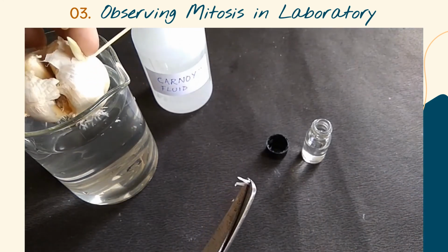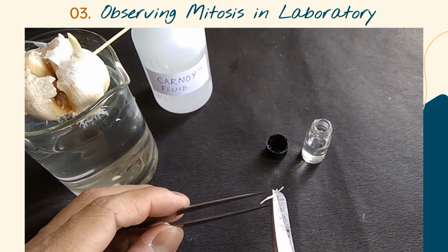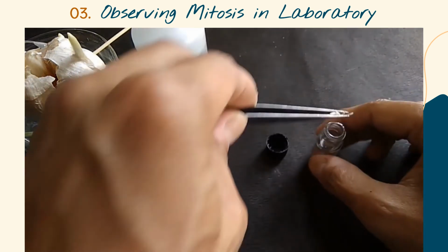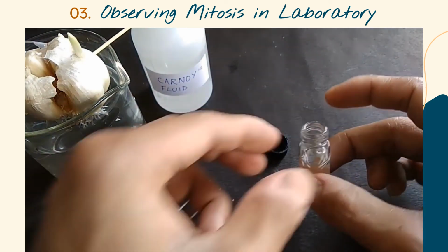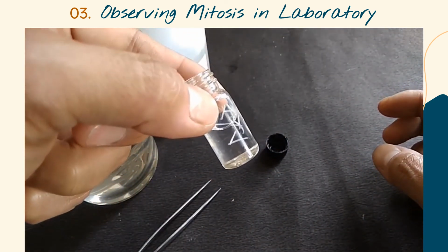If you're planning on storing the root tips for a longer time for use in future, you may transfer the fixed root tips into a second vial containing 70% ethanol. Ethanol dehydrates the root tissue and thereby preserves DNA. Root tips preserved in ethanol and preferably refrigerated will keep well for a couple of years for genetic studies.